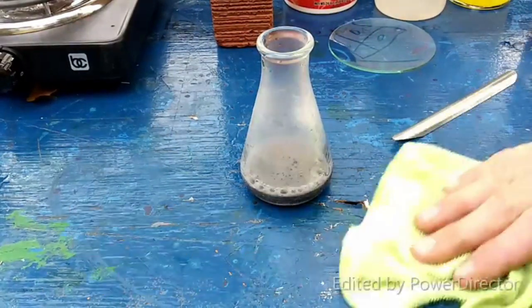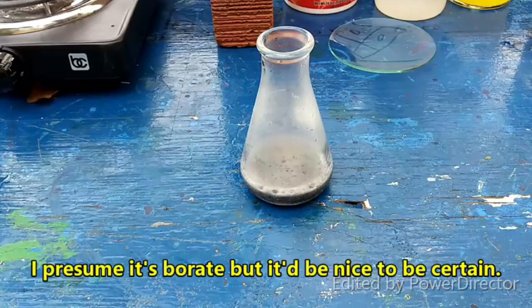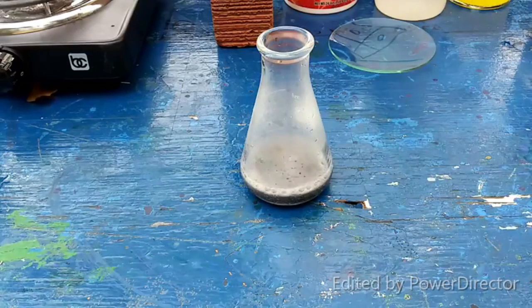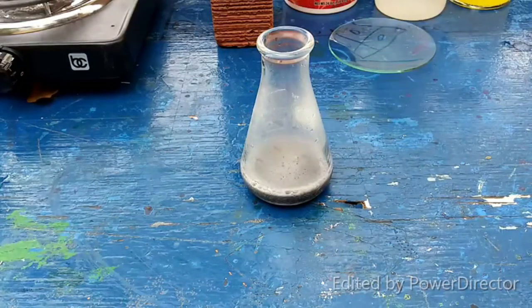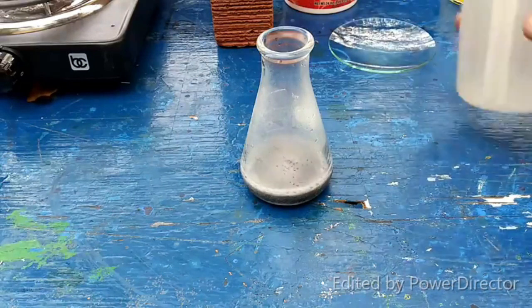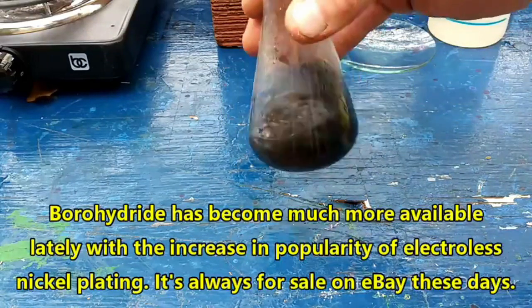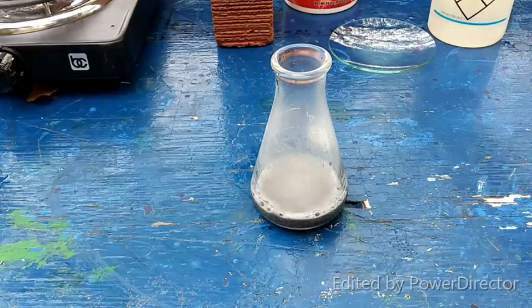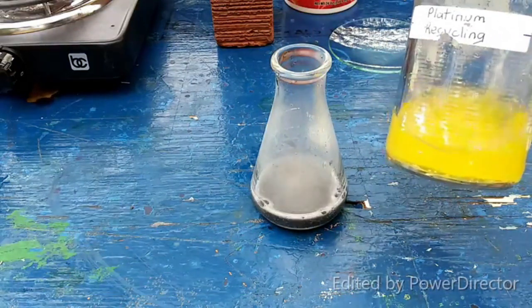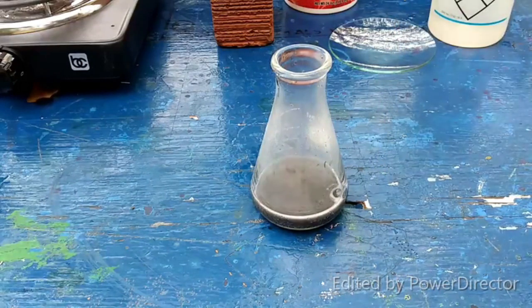Yeah, I've found that a lot of easily reducible metals, you can get them back into the metallic state in a hurry with sodium borohydride. I tell you, marvelous chemical. Absolutely love this stuff. It's expensive, though, but worth every penny. Let's see, there was some solid material left in here, so let's see if it reduces it all, which would be nice because thus far everything that I've been making has been going into platinum recycling, and this would be a nice convenient way to convert it all back to platinum.